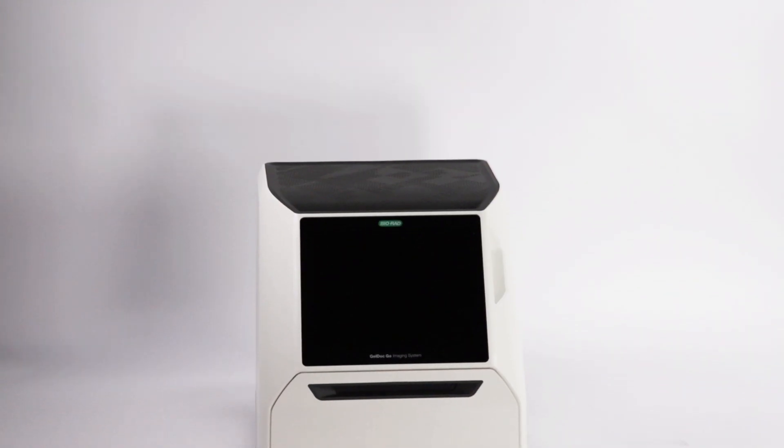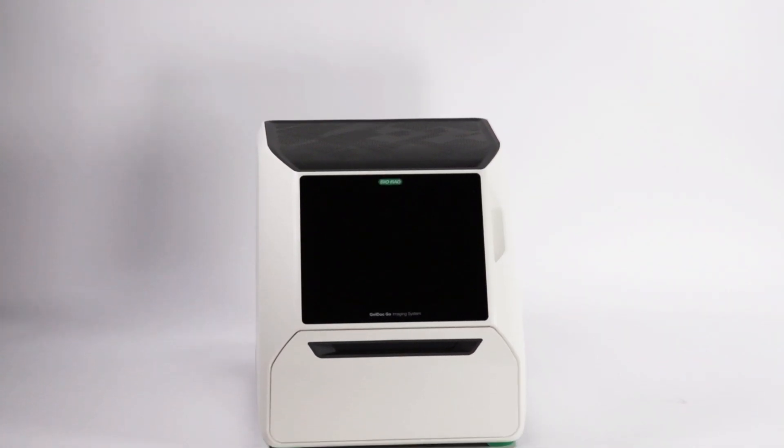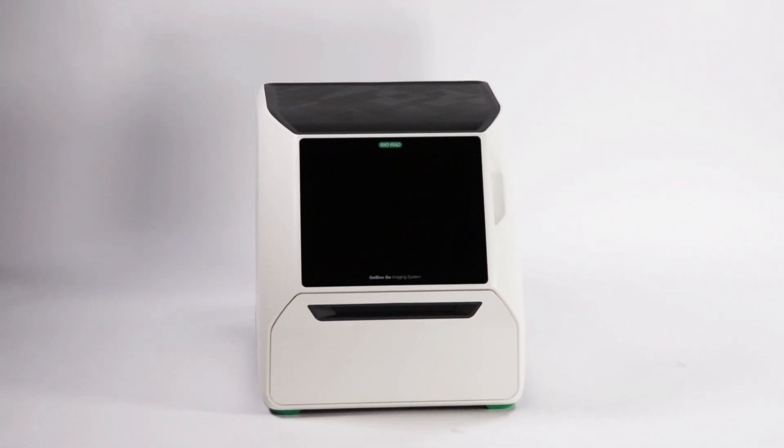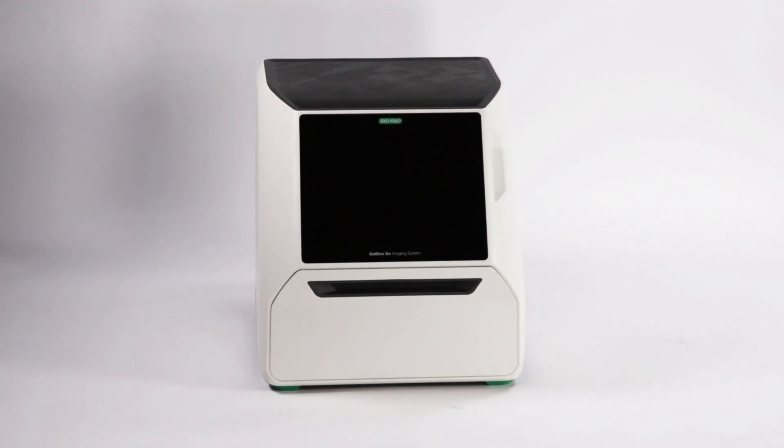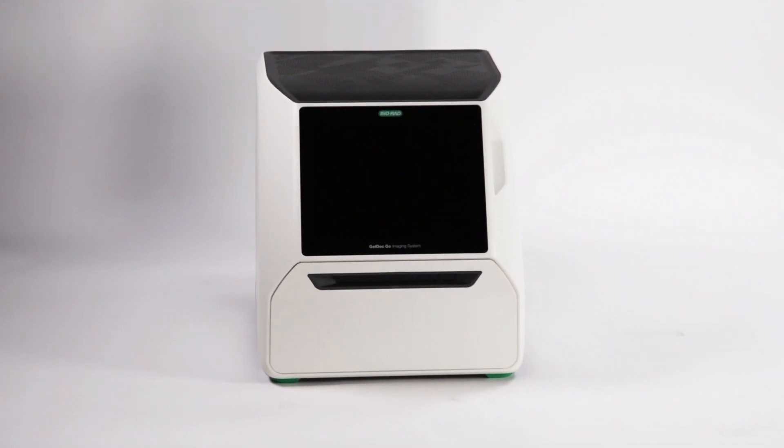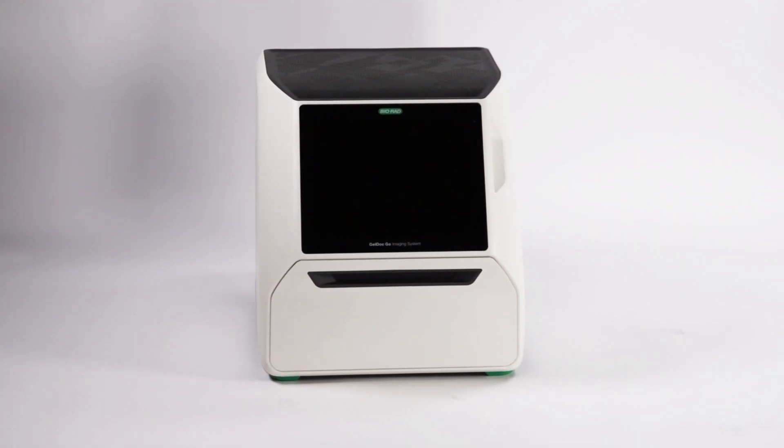The Gel.Go imaging system makes band excision on your agarose and polyacrylamide gels quick and easy.